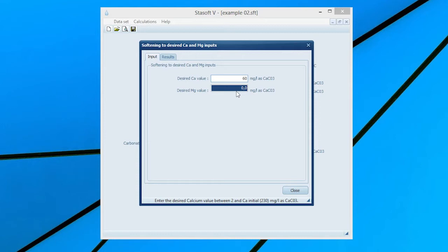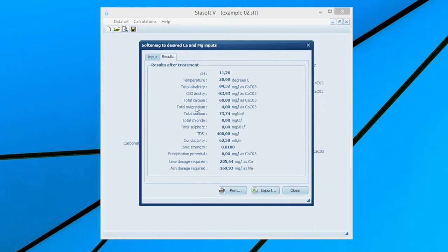Enter the specified final magnesium concentration of 4 mg as calcium carbonate by typing 4 into the desired magnesium value input box. Selection of the Results menu option will bring the Results After Treatment window onto the screen with values of the new state of water and the dosages of lime and soda ash required to soften the water to the prescribed calcium and magnesium concentrations.